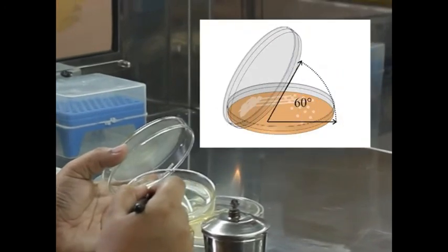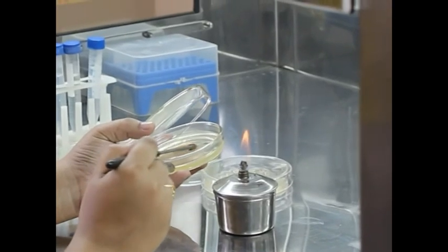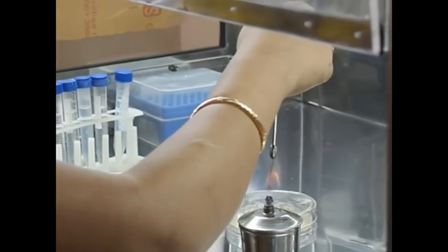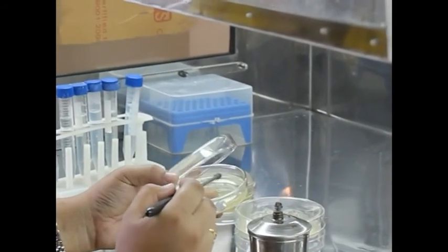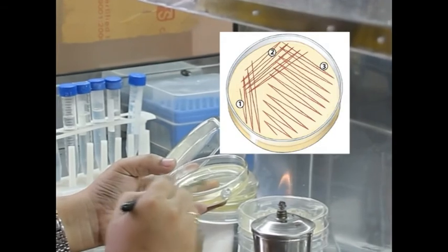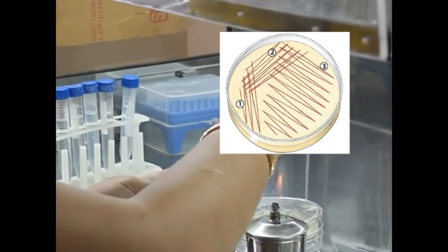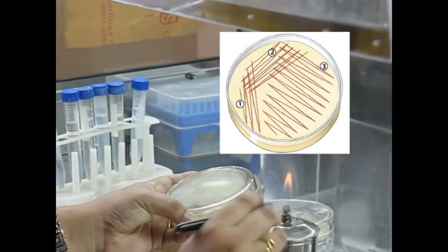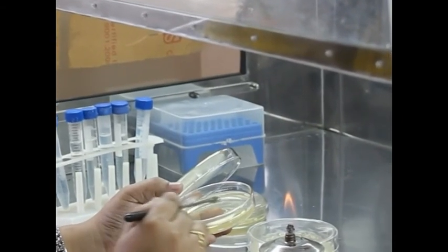Then, the Petri plate cover is lifted by the use of the left hand, holding it at a 60-degree angle. The inoculum is placed on the agar surface and streaked from side to side in parallel lines across the surface of the area. Then, the inoculation loop is reflamed and cooled, and further turning the Petri plate at a 90-degree angle, the loop is touched at the corner of the culture in area 1 and the inoculum is streaked across the agar in area 2 as shown. It should be noted that the loop should never enter area 1 again. Then the rest of the agar surface is now ready to use for complete streaking.